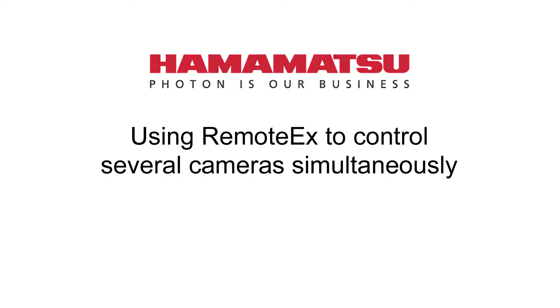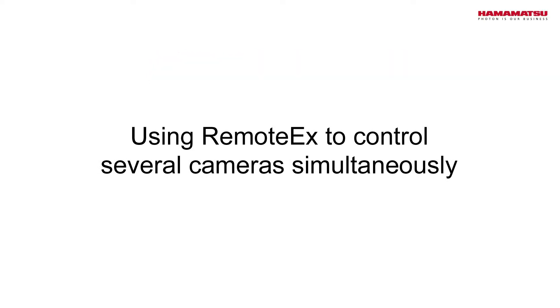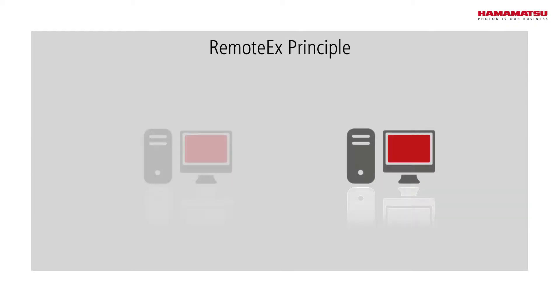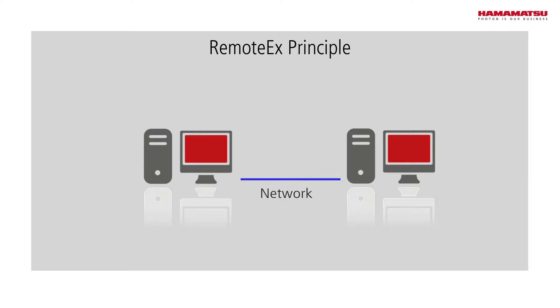This video shows how to control several cameras with the help of RemoteEx. The setup to show the principle of RemoteEx consists of two computers connected by a network.